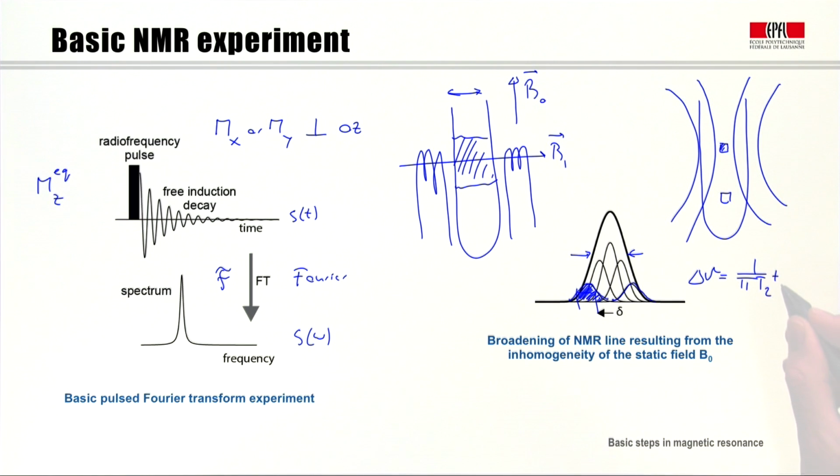You might well want to call this the true T2, the genuine or homogeneous T2, whereas the width that we have here is the apparent width, delta nu star, which is 1 over pi T2 star, and so this is the apparent width. And much of NMR is concerned with fighting this inhomogeneous broadening, as it is known, that is to say the fact that the apparent width is broader than the true width. This is something that one has to keep in mind throughout chapter 6.